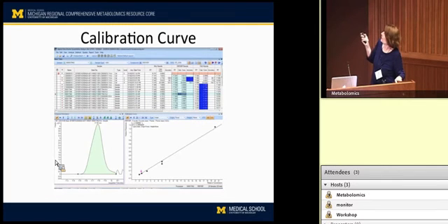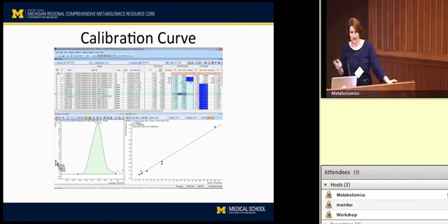In terms of that, I do want to say that this calibration curve, and you can see there's a lot of points here low, and then there's just one high. It can be tricky creating a calibration for any given set of samples, because on the one hand, for the most part, we know that a lot of our compounds are falling down in this area, and you might say, well, why do you even have that point? Because there's nothing up there.